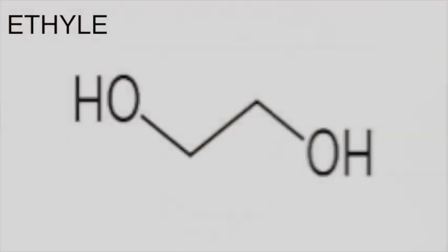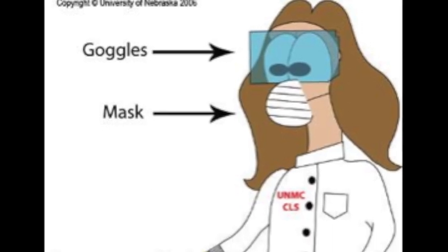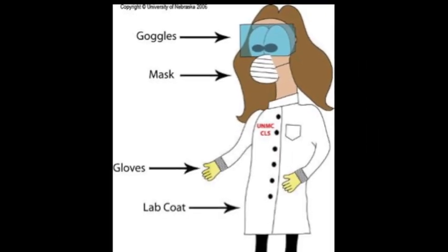Ethylene glycol is odorless and colorless. It is a toxic compound, and so ingestion of this must be avoided. This is why wearing your personal protective equipment or PPE is a must.